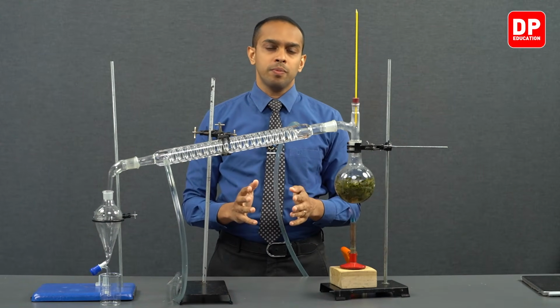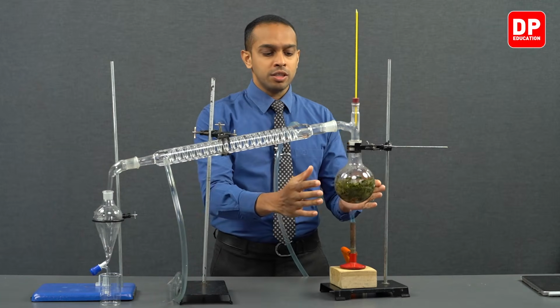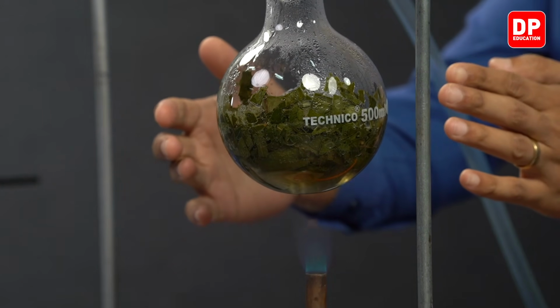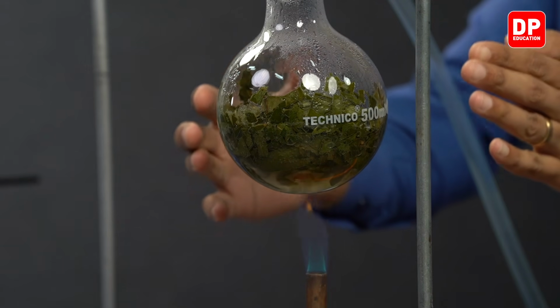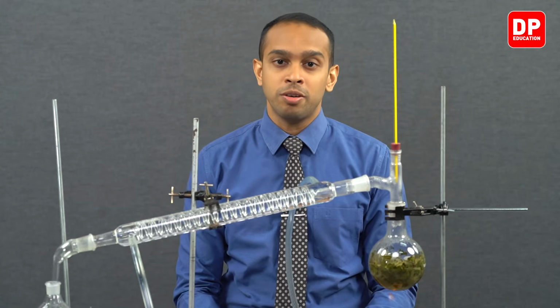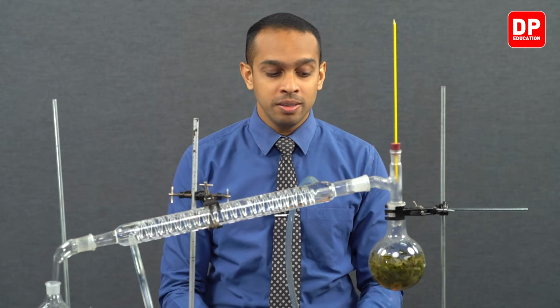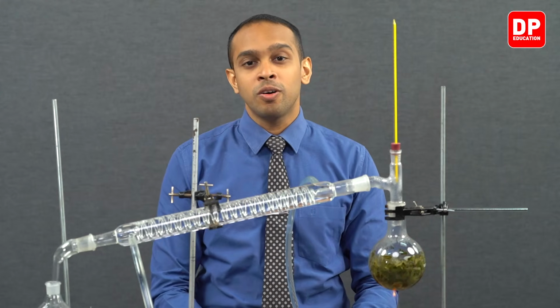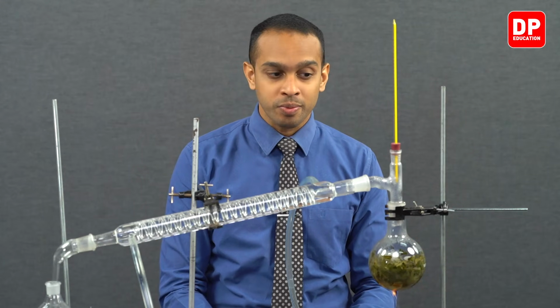Now students, as you can see, this mixture that we have over here is boiling. And I mentioned earlier, when this mixture is boiling, we will be producing a mixture of vapor, which is water vapor and the vapor of the essential oil.